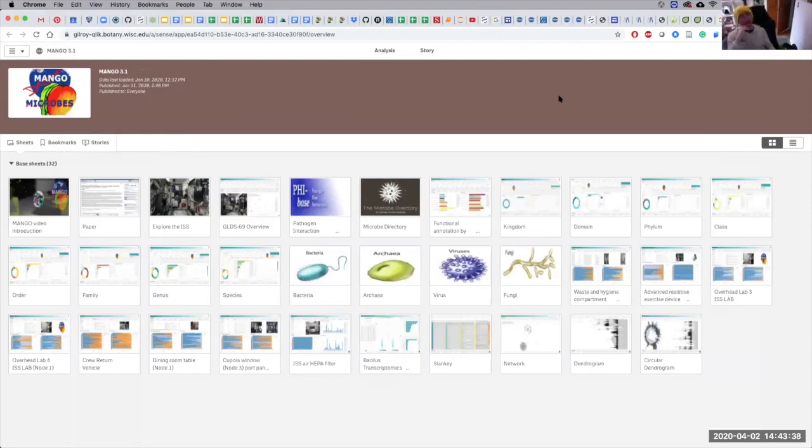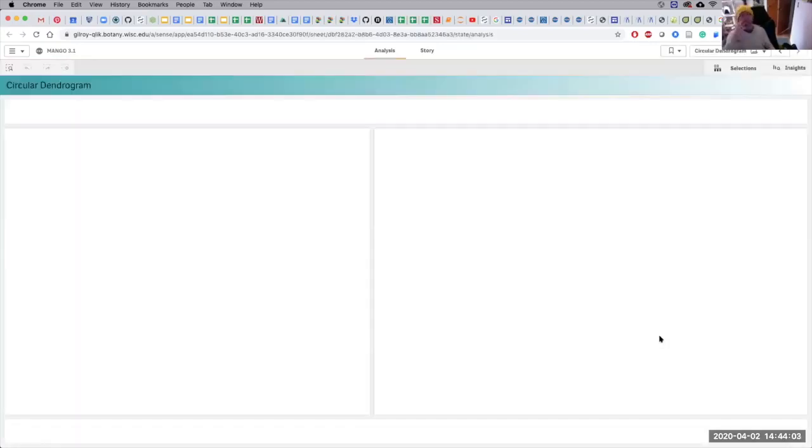Job done. Simple, same kind of thing. We have different locations on the station, so we can look at data based on location, and it kind of makes sense. Some people like the phylogenetic tree, so maybe you think of things as species, genuses, phylums, domains, all that kind of stuff. This is for your classic microbiome person. I ignore all of that. Quite like the species.